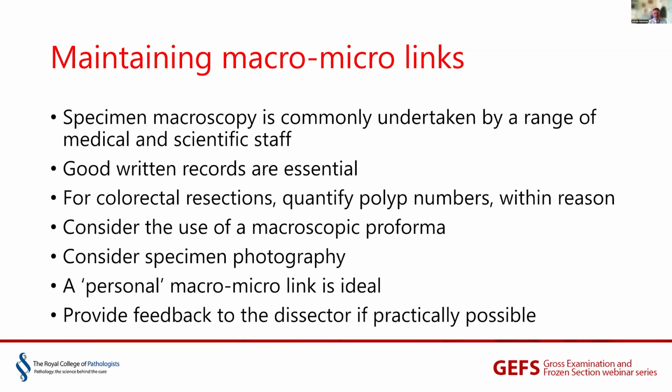So the colorectal resections, as I've said, they quantify polyp numbers within reason. I've certainly been involved in my career with our clinical genetics service here in Southampton, where I've been asked years later, this patient may have a history of polyposis. Please, can you review the specimen? Of course, the specimen and the slides may be no longer available, and the report might just say there are multiple polyps. One doesn't know what that means.